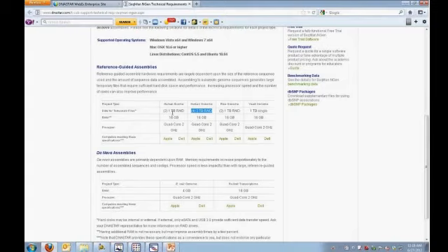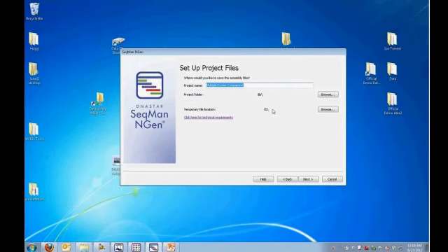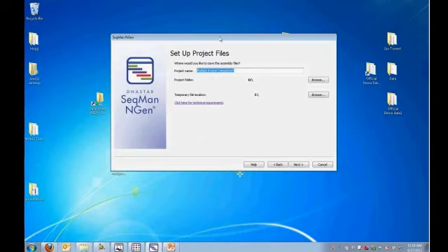And again, these can be internal drives if you have a computer that has space to put a RAID drive, or it can be an external stack of hard drives that you plug in with a USB 3 or eSATA connection, a fast transfer of data. And so that's really the main hardware requirement: make sure that you have enough disk space and a reasonably fast processor. And then the algorithm will flex. If you have more or less RAM, it can flex quite a bit and accommodate the type of hardware that you have.